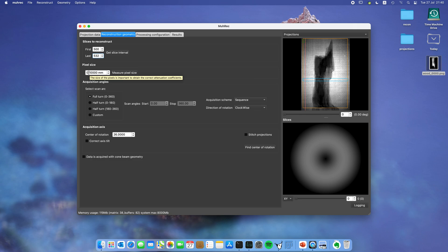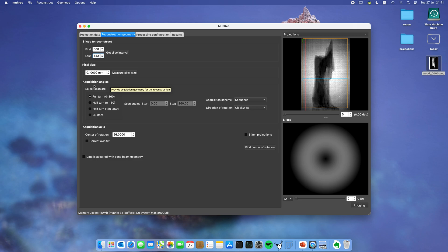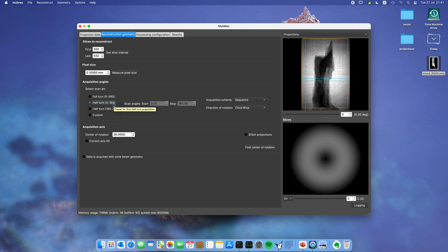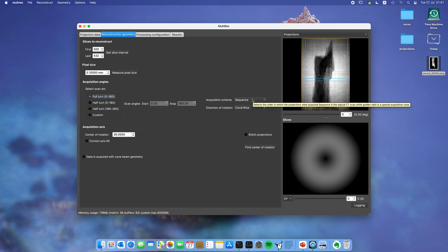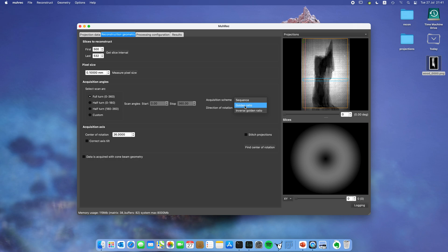Next we can set the acquisition angles. This data was acquired at 360 degrees. You can select if you want 180 degrees or 180 to 360 degrees, or you can set any arbitrary angle interval. What you also can select is acquisition scheme. The traditional way is to do small increments in a sequence, but we also have the opportunity to select golden ratio or inverse golden ratio. You can also set the direction of rotation. It has an impact on how the reconstructed image looks afterward, because it will be mirrored if you do one or the other.